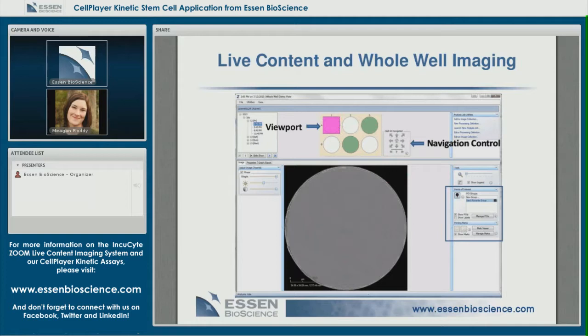As you'll see in a movie shortly, when you zoom into the well and focus on different areas, the viewport will change — it'll become smaller as you zoom in, and it will keep up with you as you pan through the well.